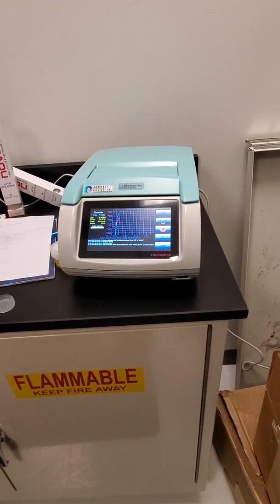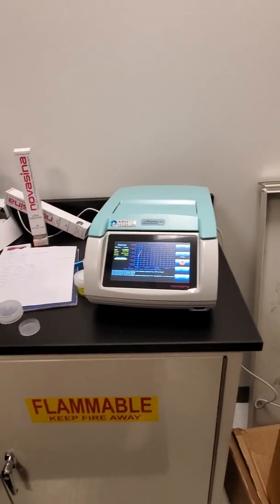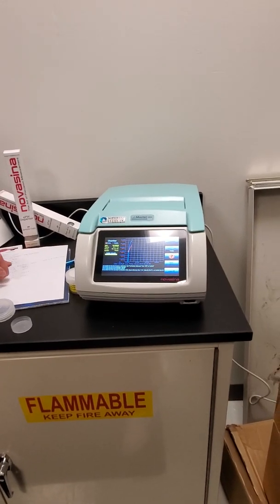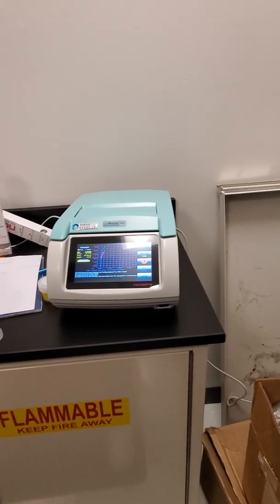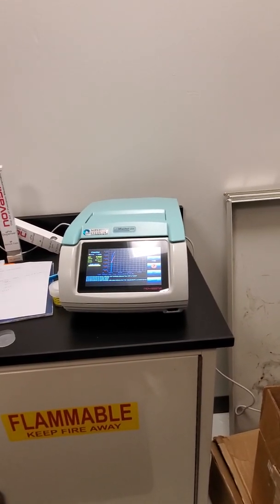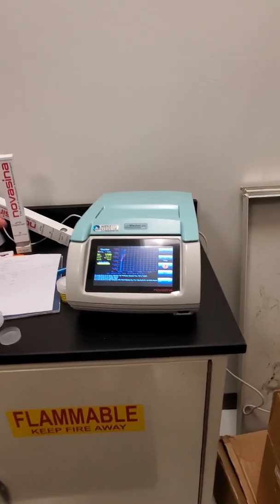Now, when you put the filter in, you don't necessarily want to just run with the filter. You could put the Redox in and read everything with that except for these ones that need the 21. All your other ones could read fine with that, but having the filter in does extend the test a little bit because it has to move through the filter. So it's not necessary that you always want to have the filter in there.